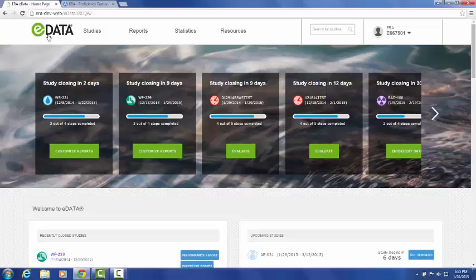Thank you very much for attending today's presentation on basic navigation and completing the 4-step process to completing a PT study in eDATA 2.0. This webinar has been recorded and will be posted on our website, www.eraqc.com. All of what we covered today, as well as the additional functionality that will be reviewed during our second webinar on February 10th, will be provided in a user's manual that will be available on eraqc.com when the new eDATA system launches on February 16th.